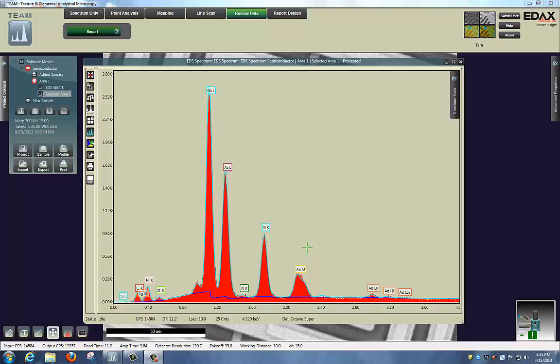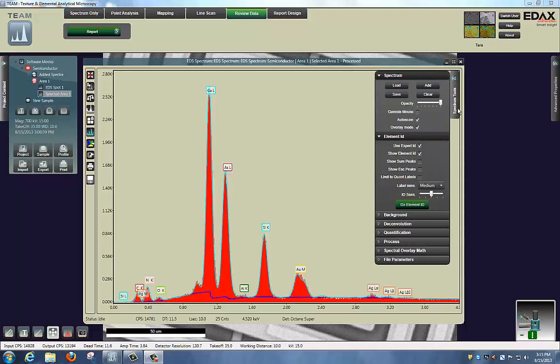In this software movie, we'll take a little bit more in-depth view at some of the Spectra Tools capabilities. These are found in the Spectrum Tools area located in the upper right of the Spectrum window. To get at this panel, I simply hover my mouse over the area, and if I want to keep it out, I click on the triangle, and then the window will stay out.